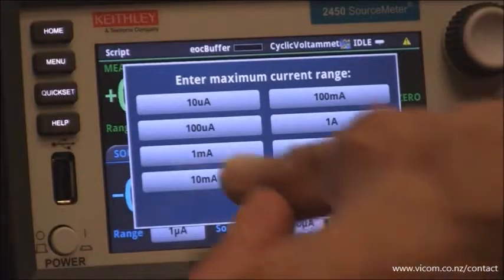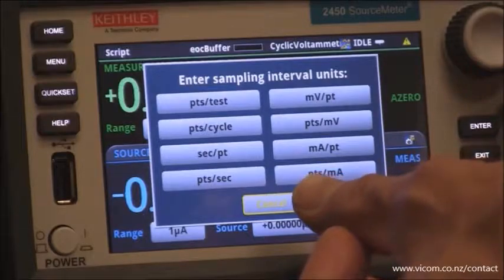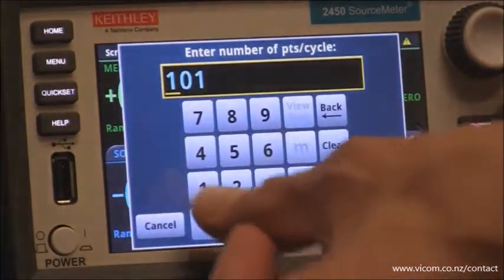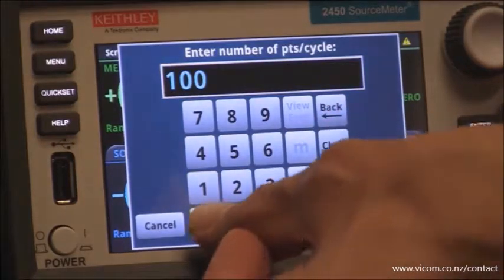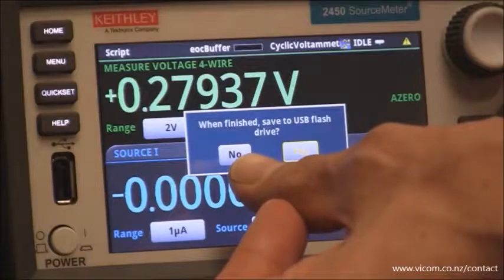For the maximum current range, we're going to select a milliamp based on the chemistry. The sampling interval units — we're going to select the number of points per cycle, and I'm going to select 1,000 points per cycle. Am I going to save the data to the USB stick? I'm not today.